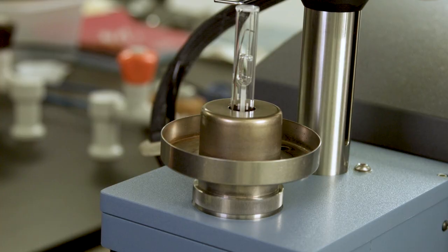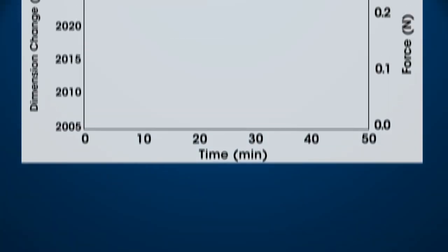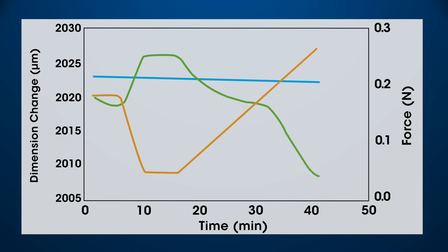The TMA Film Fiber Setup allows measurement of physical properties of fibers and films as a function of force, temperature, or time.